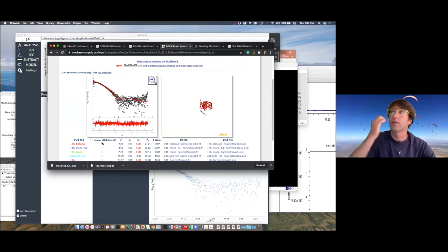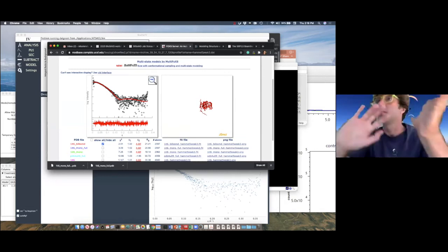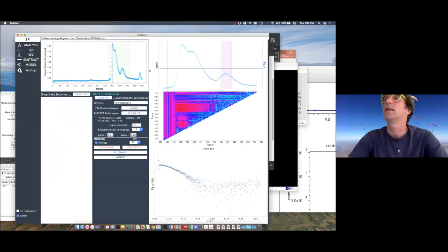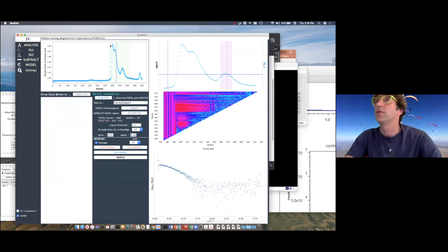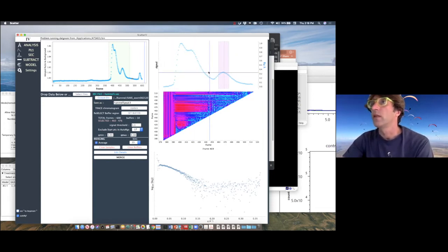And you can optimize even the details like extended linkers. Okay, I remember there have also been some questions, and I'm really going from back to front, but now we have this case that I want to go back again and really look at the point of interest. What is this peak, or basically split peaks? So how am I going to deal with that? Again, I can select that, and in this case I'm going to clear the buffer and select the buffer here.